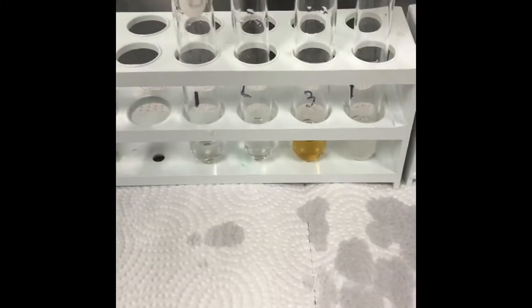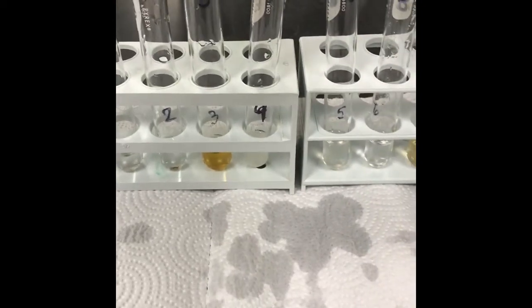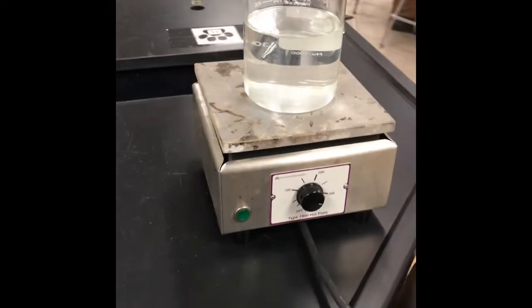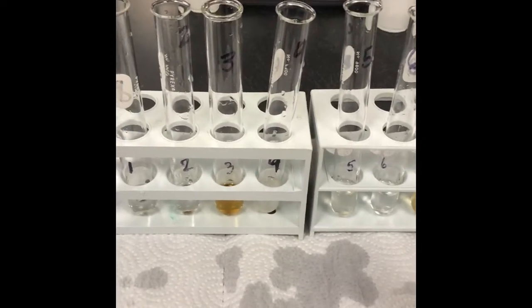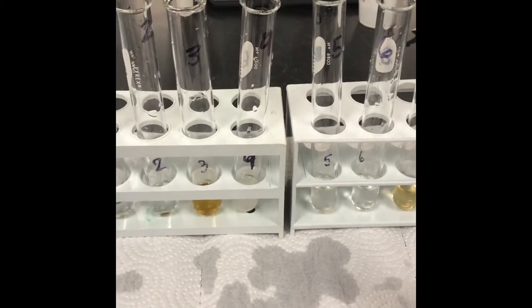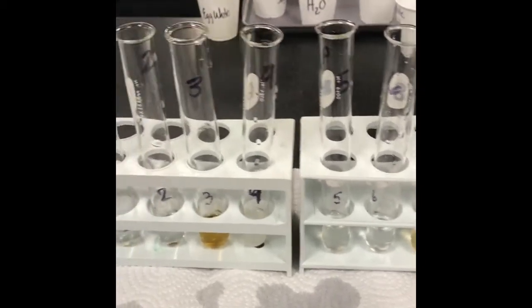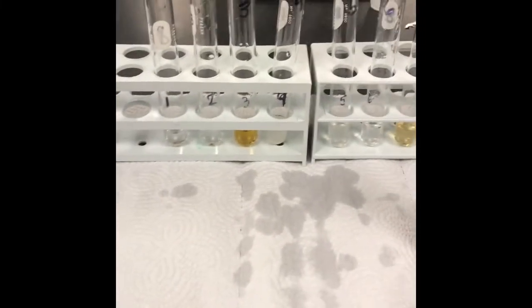If any of the substances listed here have any of those monosaccharides, then when we add Benedict's solution and heat it up, here's our hot water bath, for 4 minutes, we will get a shade of burnt orange, or an orange color at all. Any kind of orange is going to indicate positive for monosaccharides. The darker orange, obviously, the stronger the monosaccharide is in the substance. If it's really, really dark orange, we're going to give it a 3+. If it's medium, a 2+, and a light shade of orange is going to get a 1+.